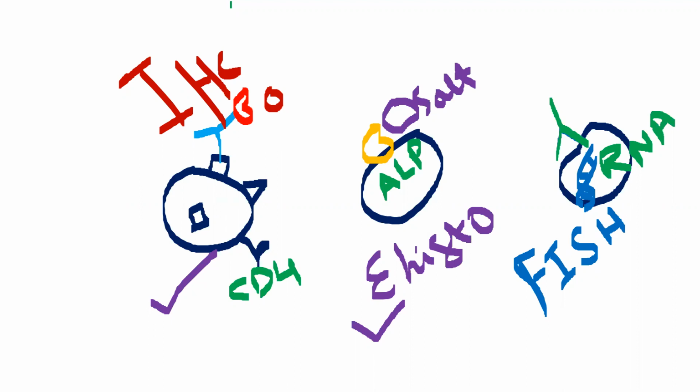That is how we got a new technique. Now I will discuss this new technique. This new technique is called flow cytometry. I'm writing here: flow cytometry. It is a cell counting procedure.